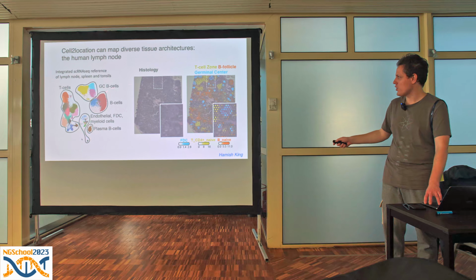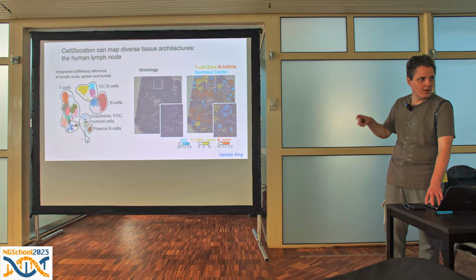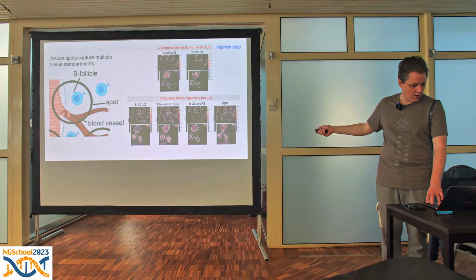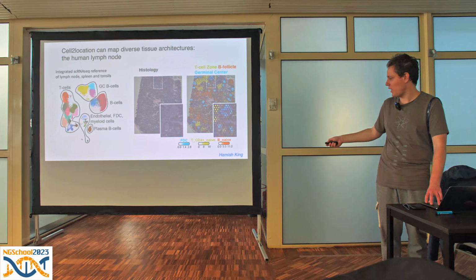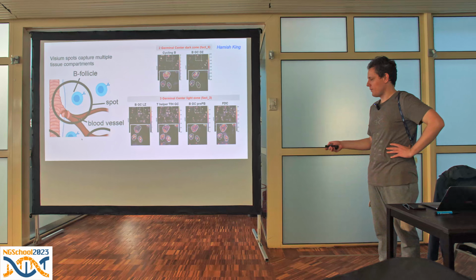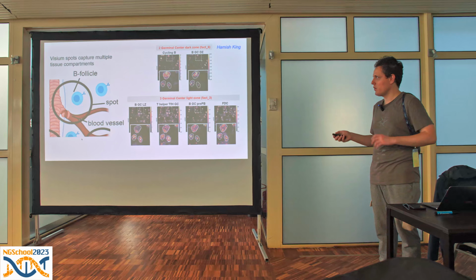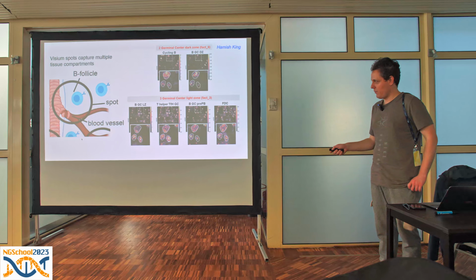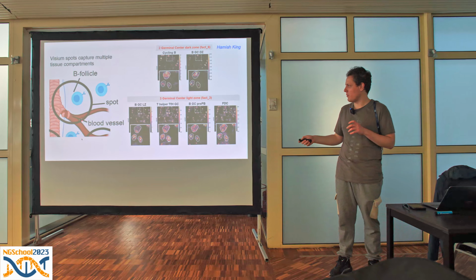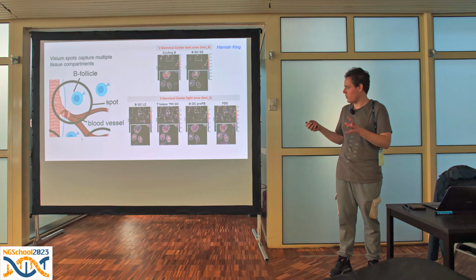It's quite mismatched to the Visium data. We took Visium data from 10x, and this is exactly the data set that we will look at in the tutorial. And the goal in the tutorial would be to reproduce the results that we observe here. So once we have cell abundance, this is just abundance of 3 cell types, but once we have everything, we can factorize cell abundance using the non-negative matrix factorization to get at distinct cellular neighborhoods. And again, we have to deal with the fact that because of Visium resolution, in these highly cellularly dense tissues, it will capture not just distinct cell types, but also distinct structures, like blood vessel versus more functional part of the tissue.